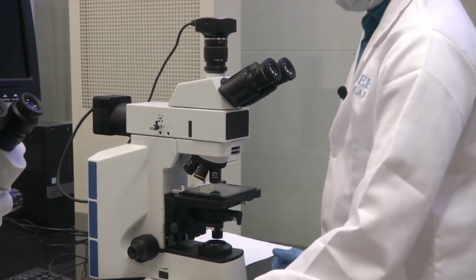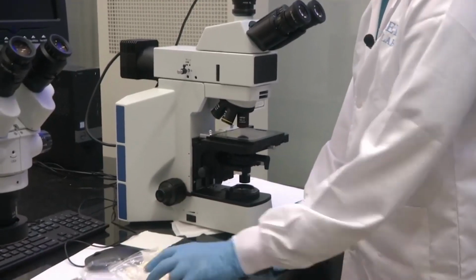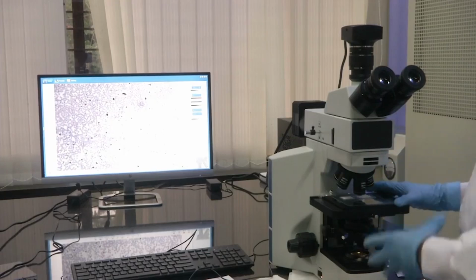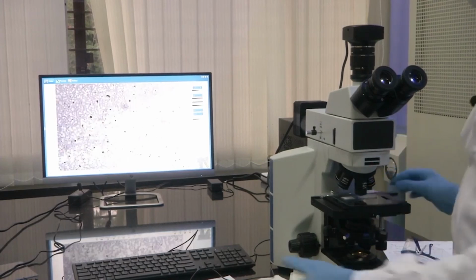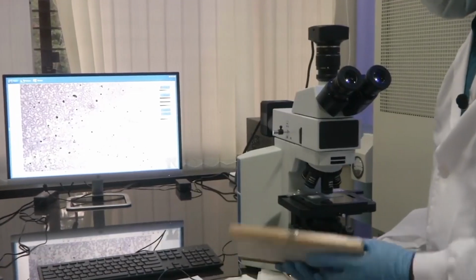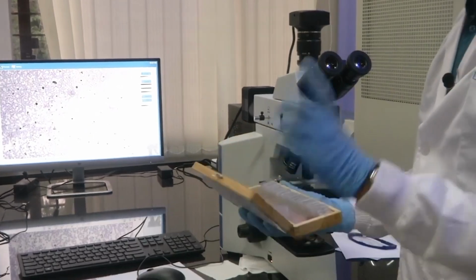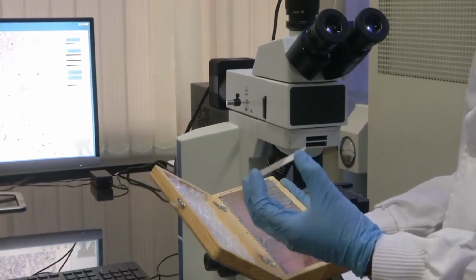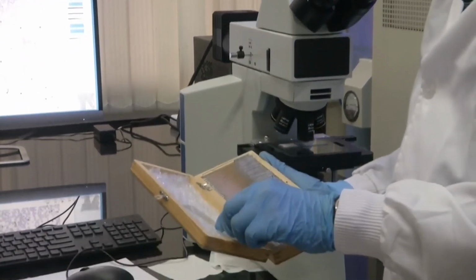Now, we will look at one or two samples, and see how bottom illumination captures images, how top illumination captures images, etc. We will see a particular sample and how we are seeing the image through the microscope. There is something called a box of samples, readily available for purchase, which has representative samples of different cell types. These are slides that are all inactivated, nothing to worry about. These are used for us to study, purely for academic purposes.